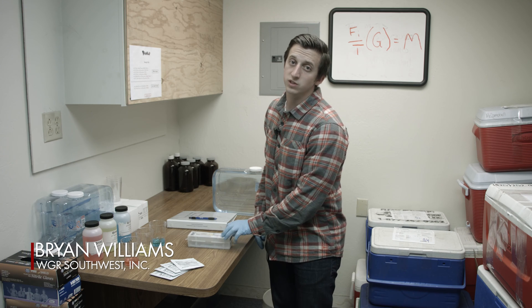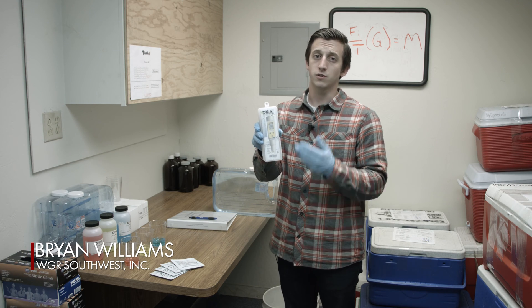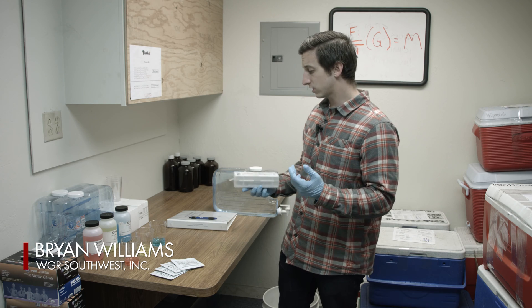Hey guys, I'm Brian Williams with WGR and today we're going to show you how to do a three-point calibration on your pH pen. So let's get started.